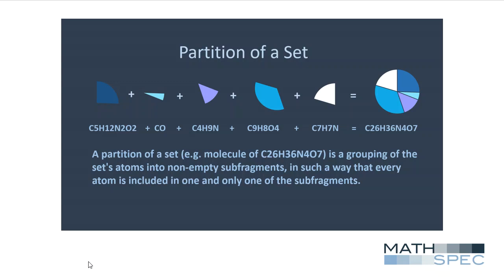The subfragment masses that comprise partitions are then converted into combinations of atoms in such a way that all atoms that comprise the molecular formula of the whole molecule are allocated into subsets of 3, 4, or 5 groups of atoms. Each atom of the molecular formula can be found in one and only one subset. This subset is what we call a subformula. Lastly, possible spatial alignments are also assigned based on logic tables, and that results in modular structures.